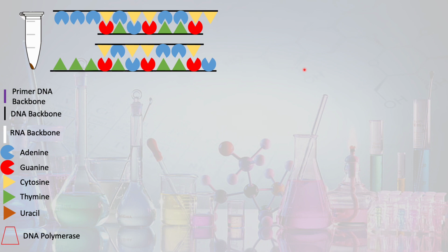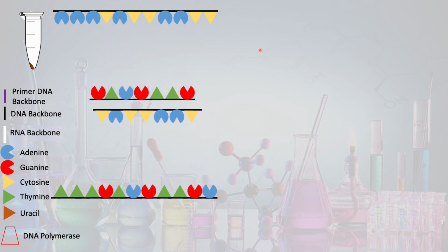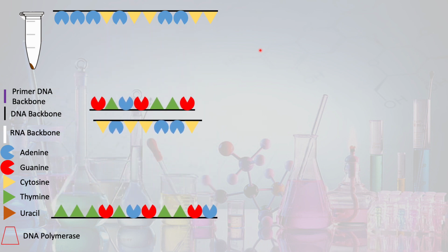But the primers that we're designing, just to reemphasize, play a role in our RT-PCR process. We've discussed previously in the PCR overview video that as we place our samples into our thermocycler, which is going to heat up and cool down, each cycle of that heating will help break apart the 2 strands of DNA molecules that are produced.